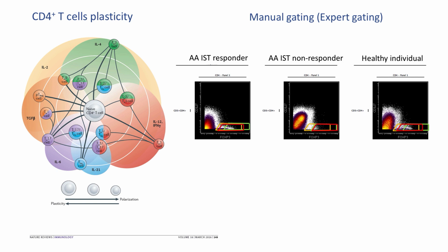Perhaps you may know or not, but I'm a hematologist and my background is bone marrow failure syndromes. One of the common causes of bone marrow failure is aplastic anemia, which is a rare disease. And we have shown that regulatory T cells are reduced in number and function in these patients, and lack of function and number of Tregs can be a predictive biomarker for response to therapy in these patients. Nevertheless, what we have noticed is how we define Tregs.